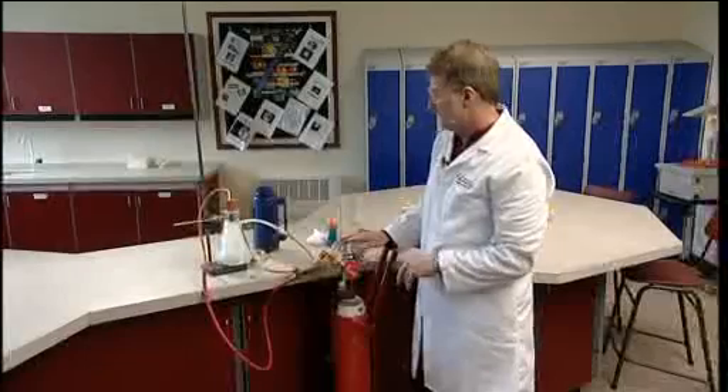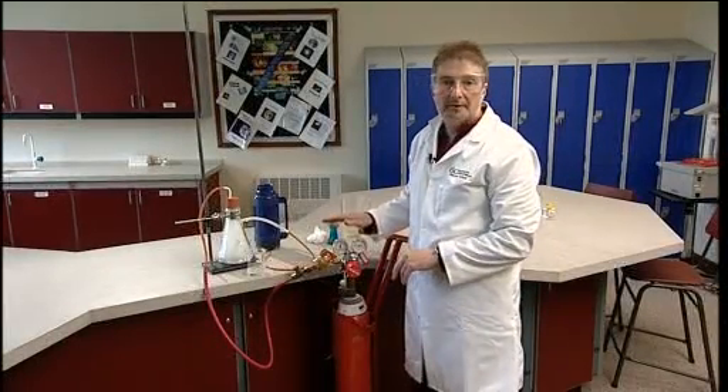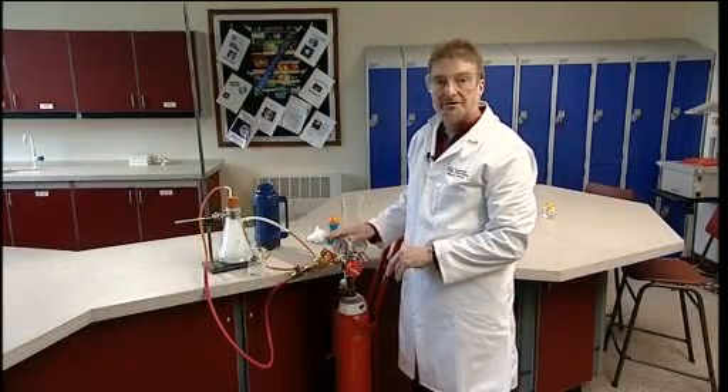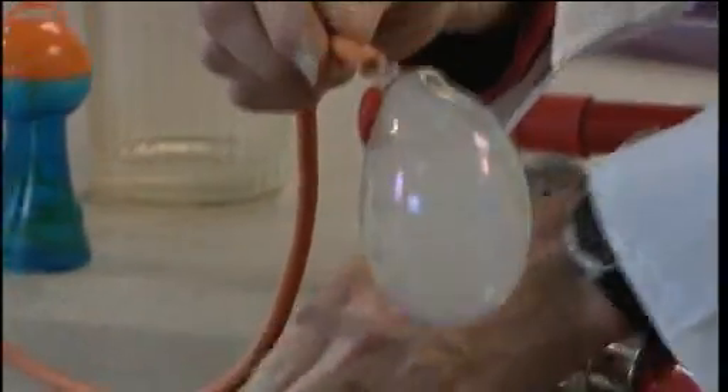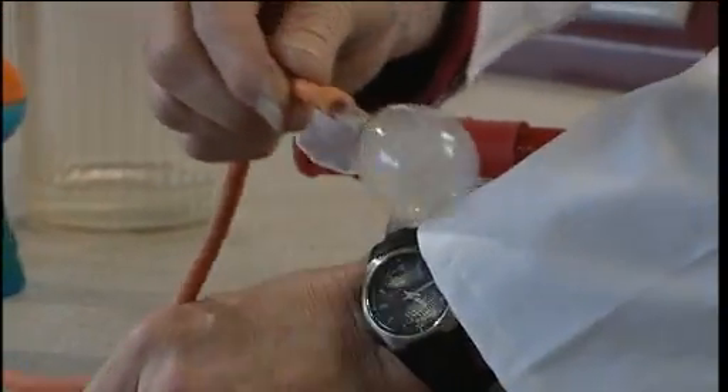Once you've got the carbon dioxide going, it's possible to turn the hydrogen on again and try to blow bubbles with a mixture of hydrogen and carbon dioxide. With a little practice, you'll be able to produce bubbles which first sink and then begin to float upwards.